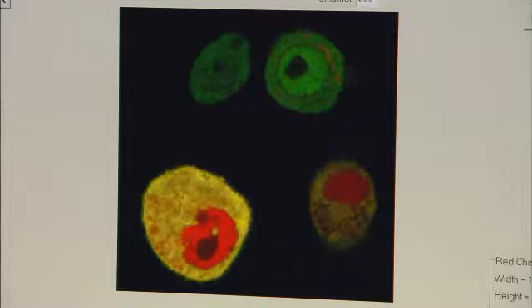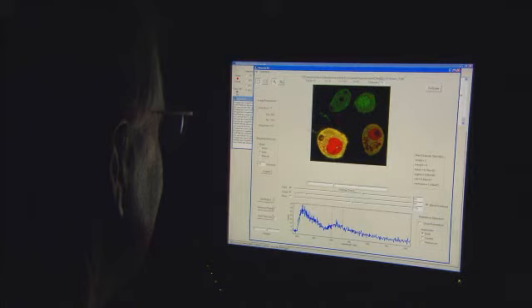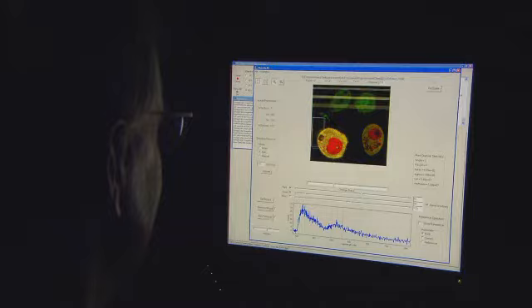The team faced multiple challenges in developing the system. To truly understand what happens at the component level of cells, they needed better image resolution and speed to image live cells.